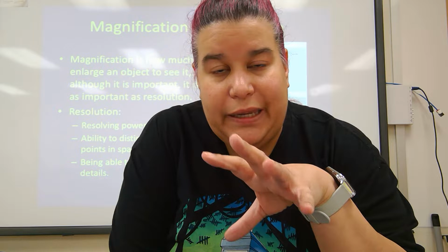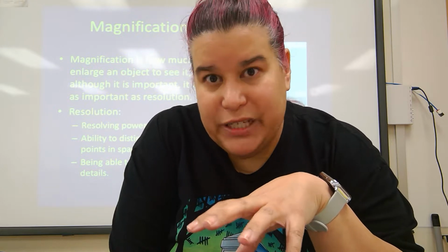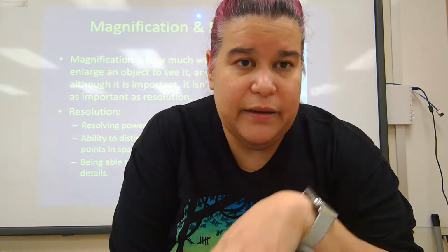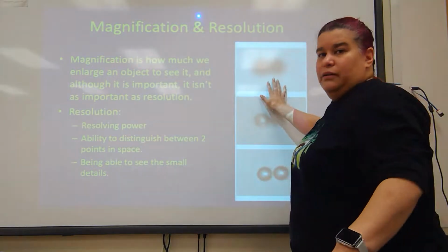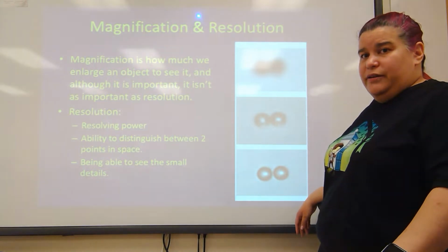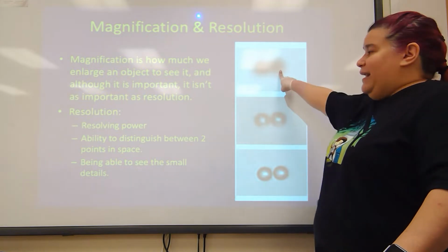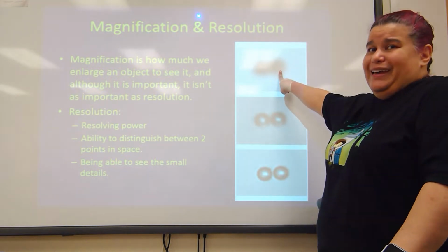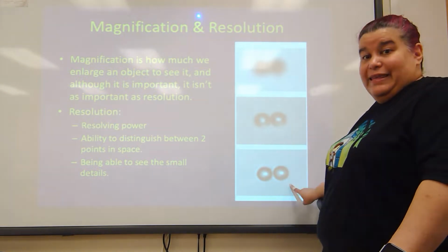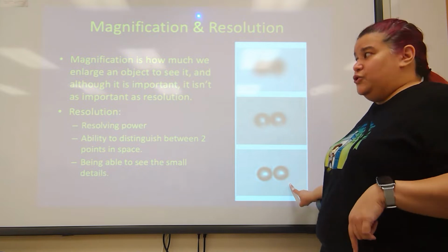With a microscope in microbiology, you can't just have magnification, because if it's just magnification without resolution, you lose all the details of what you're looking at. So here, these three pictures are all the same magnification. What's the difference? The resolution. That has no resolution. Did we magnify it? Yeah. That has a bit more resolution, but it isn't all that great. This has both magnification, we can see the details, so it has resolution as well.